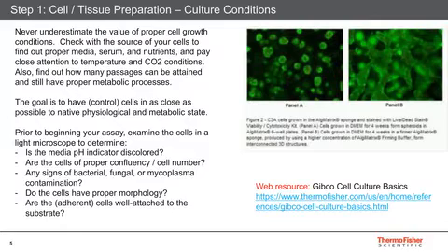So when you first begin, make sure that your cells, or at least your control cells, are as close as possible to their native physiology and metabolic state. So proper culturing conditions.